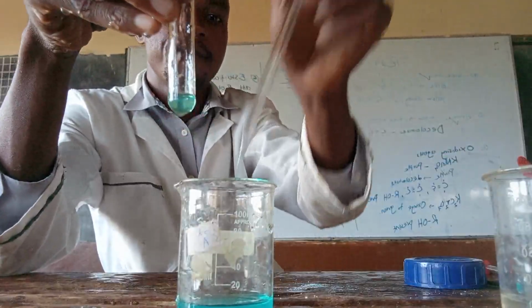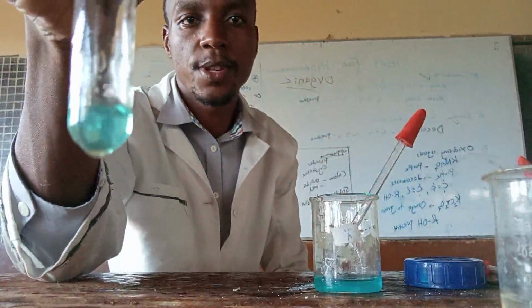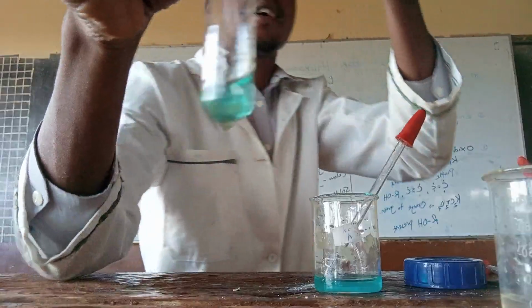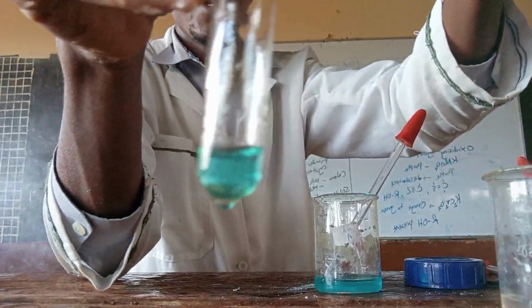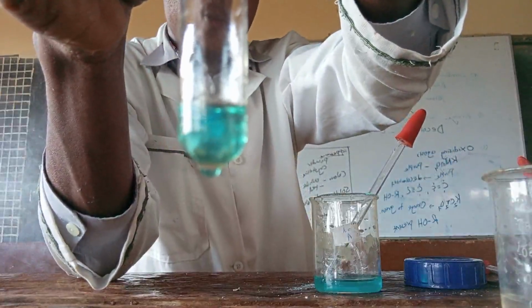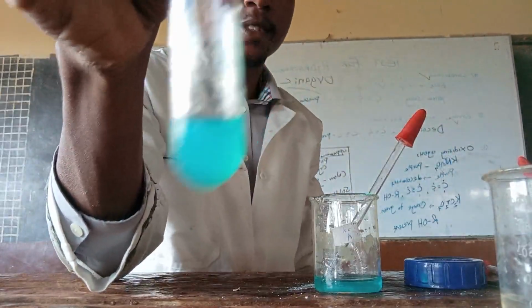It's a colored ion. See, blue solution. Then two drops of sodium hydroxide. 1, 2, 3. The blue precipitate is now formed.